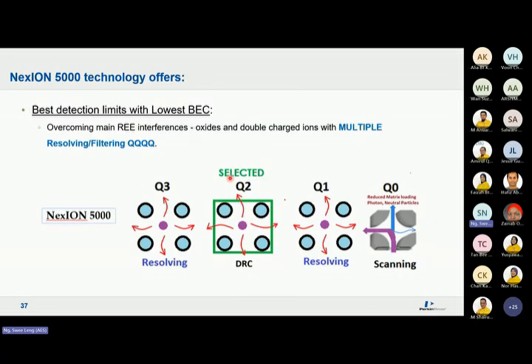So just now I told you all the problems of the background. When you look at purchasing ICPMS, your mentality has to be how I want to remove BEC to the lowest. B means background, E is the equivalent, or we say background equivalent concentration.